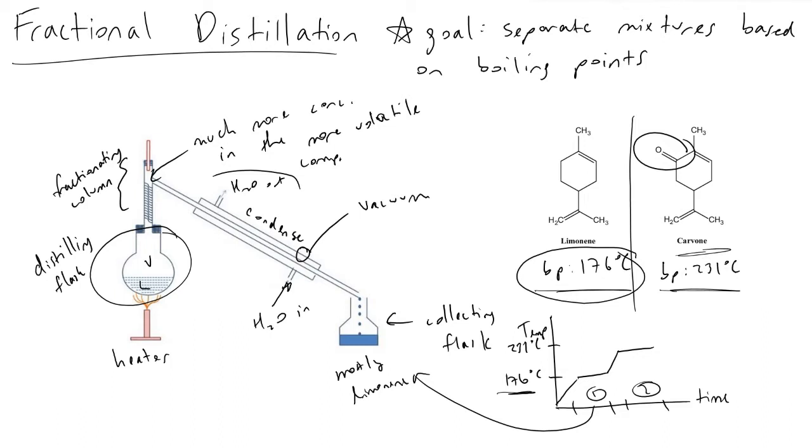And then finally, you do hear a term called superheating. And superheating is this interesting concept that occurs because of surface tension. So we all know, if we've ever done a belly flop on water, that water has a lot of surface tension and it can be painful.